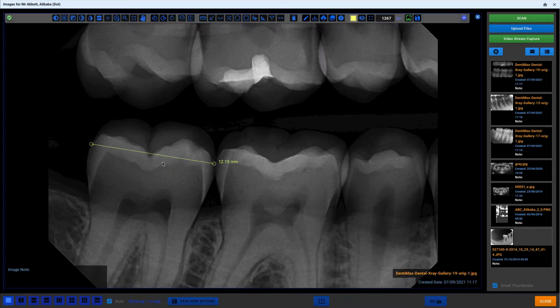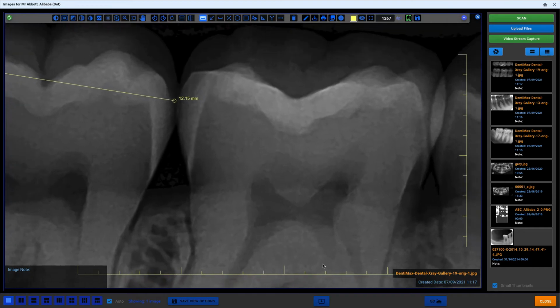And it did. I can use Hide Show Annotations button to display or hide the annotations. Let us now have a look at the annotation tools. The scale overlay adds vertical and horizontal scales with 1 mm interval. When the image is zoomed, the scales are recalculated to still show the correct ruling. All the annotations get adjusted to the image rotation, and they will always show in the correct orientation and size.